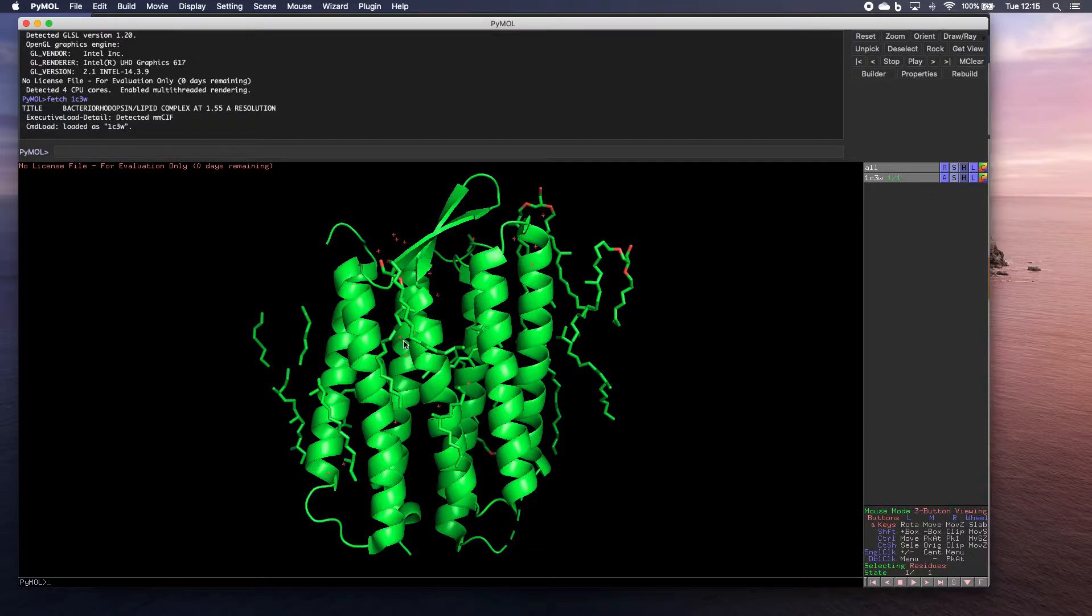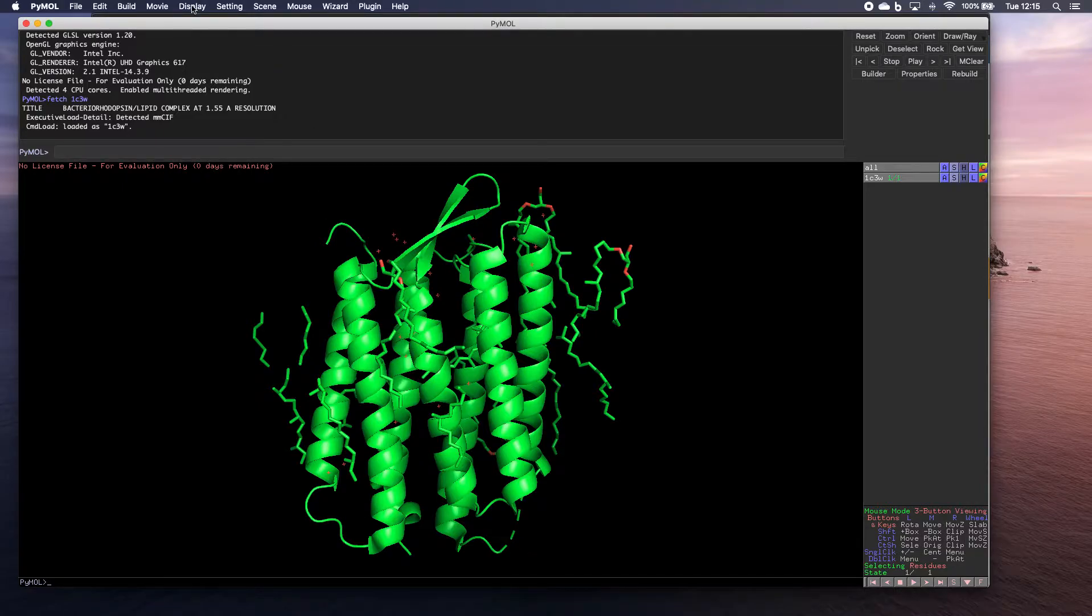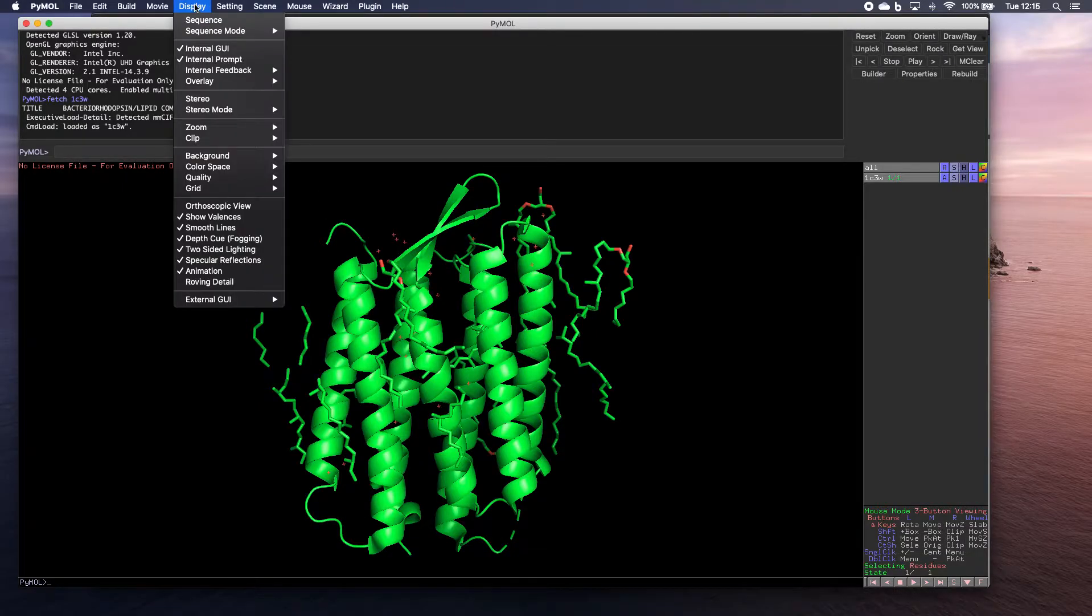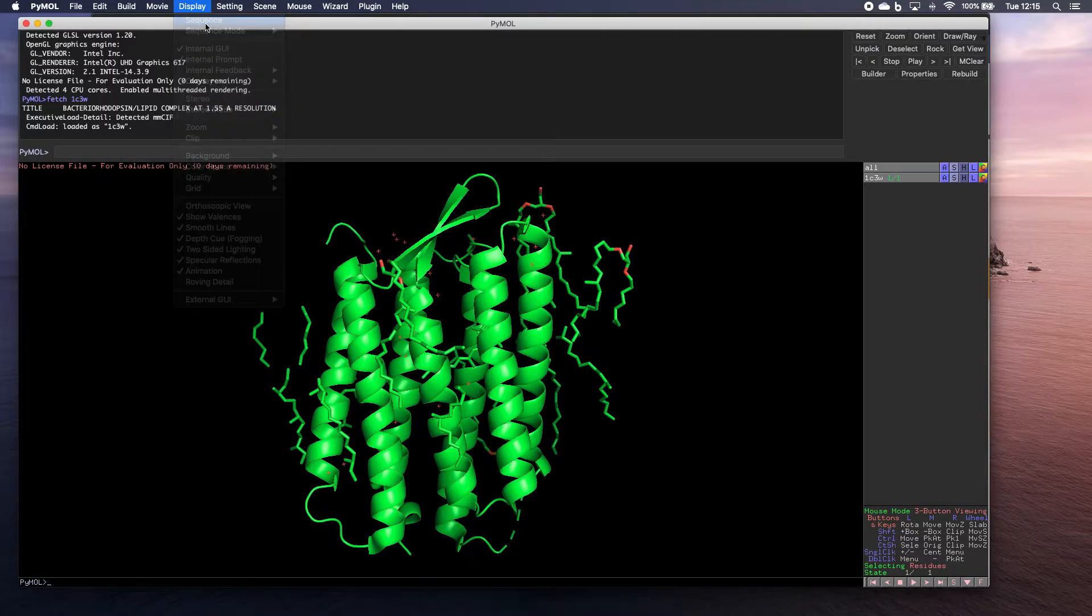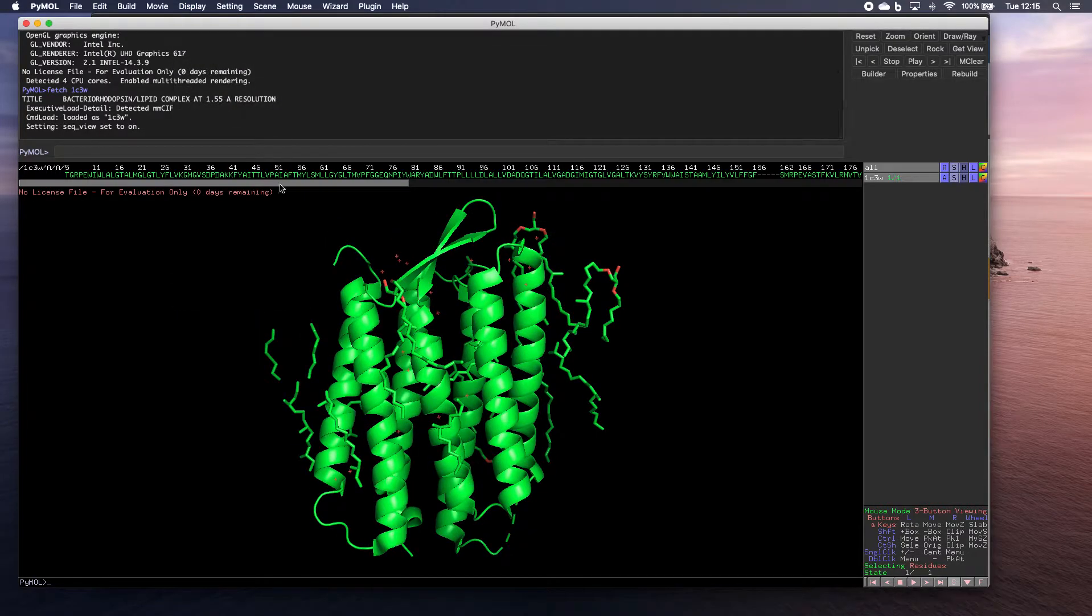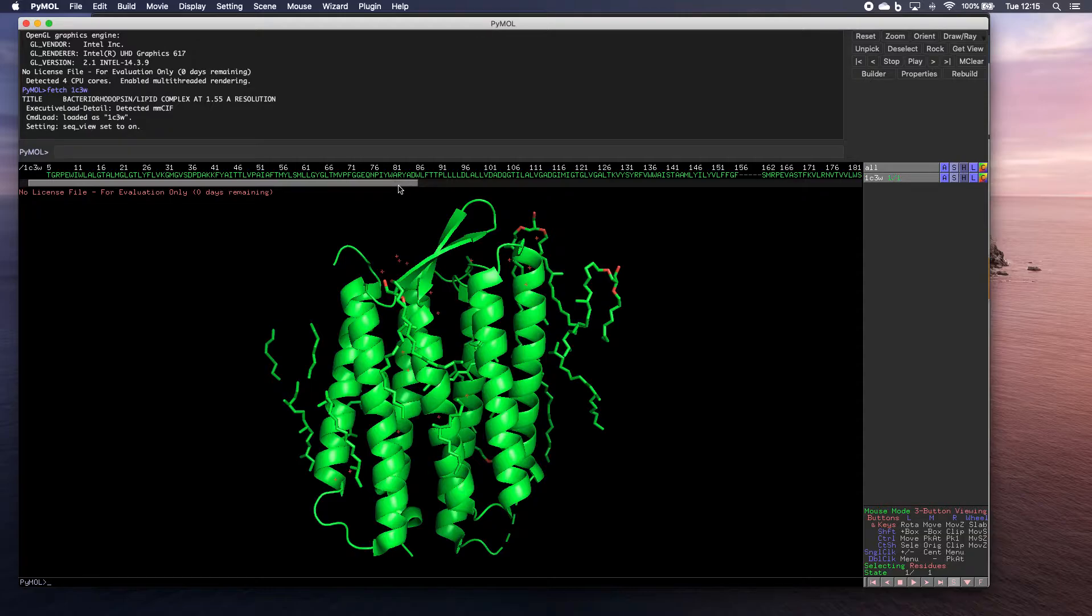Now, one of the first things I'd like to do is you want to go up here and I need you to go to display and turn on sequence. Now we've got this window that's appeared up here.